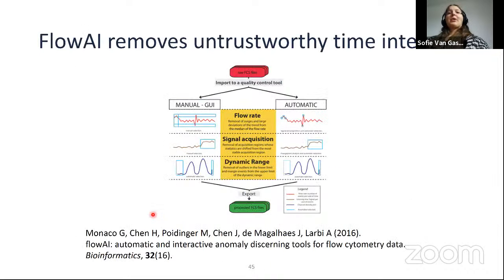Actually, we're also currently working on a new tool called Peacock in our lab, which tries to improve on this a bit further, which will be sent out soon and then hopefully go through a smooth reviewing process. But the tool is already available on GitHub at the SciSlab GitHub. So if you're interested in trying it out, you can already go there and give it a try.